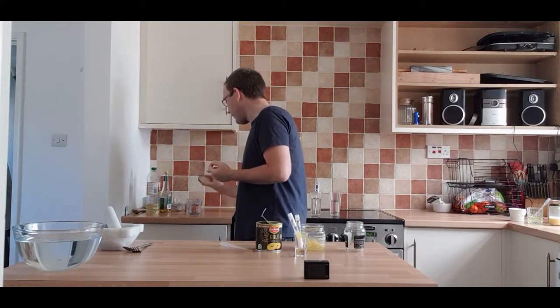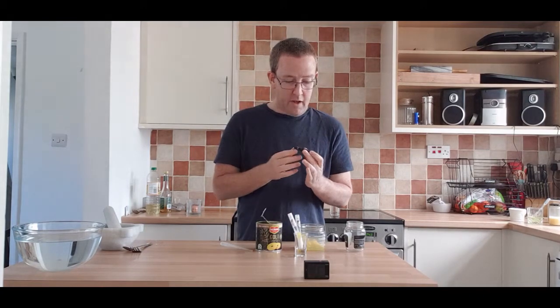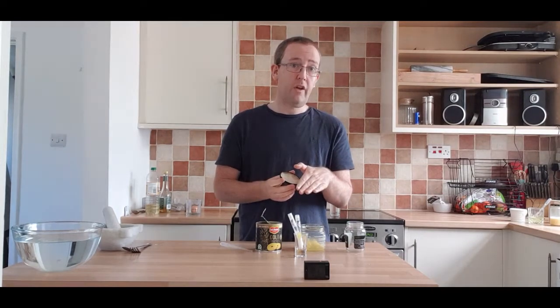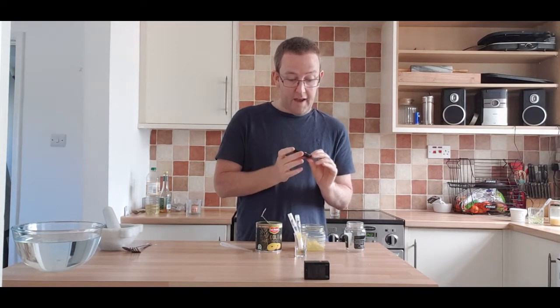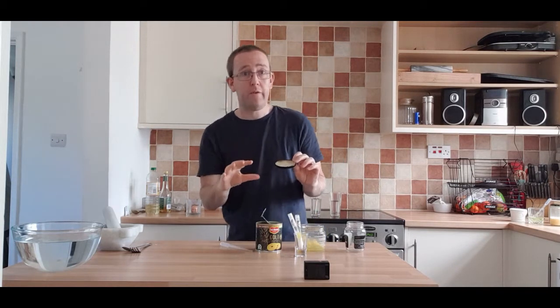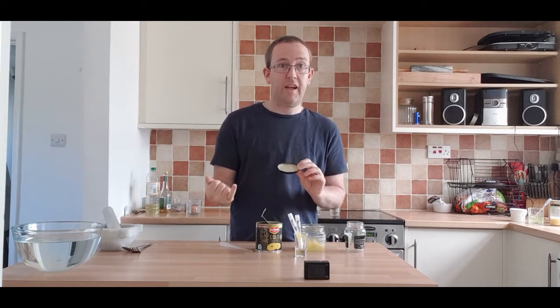Now I did try a different experiment to show you as well, which is more like one you might get on an exam, which is to make a little plate of cooked egg white and cut holes in it. And then put the pineapple juice in there to experiment with concentration. Because remember, the variables you're expected to know about are temperature, pH, how they affect enzymes, of course, but then concentration of substrate, concentration of enzyme, and of course, inhibition.